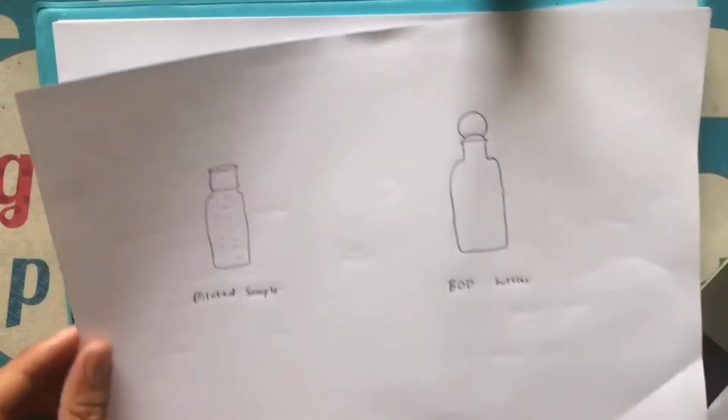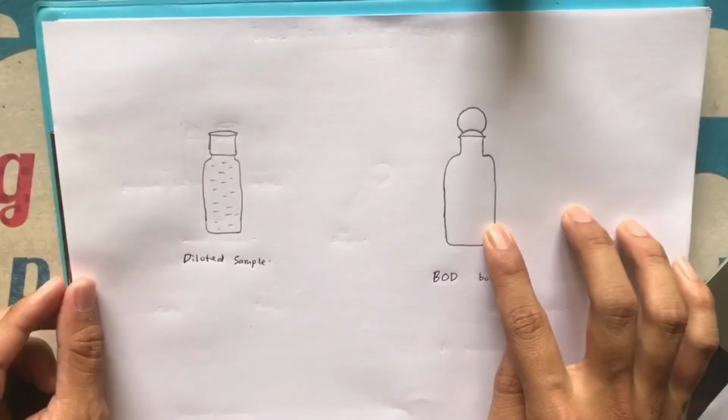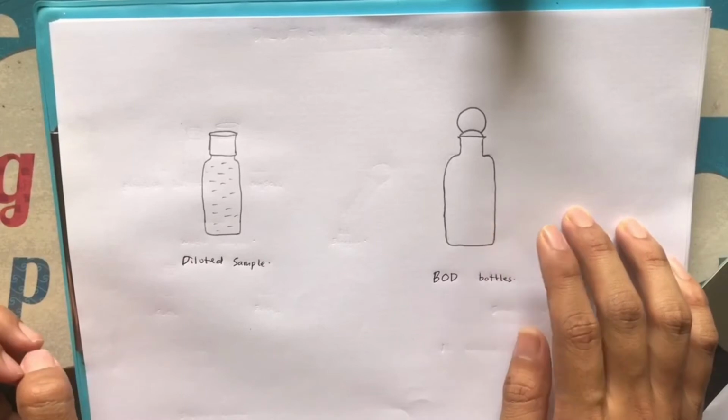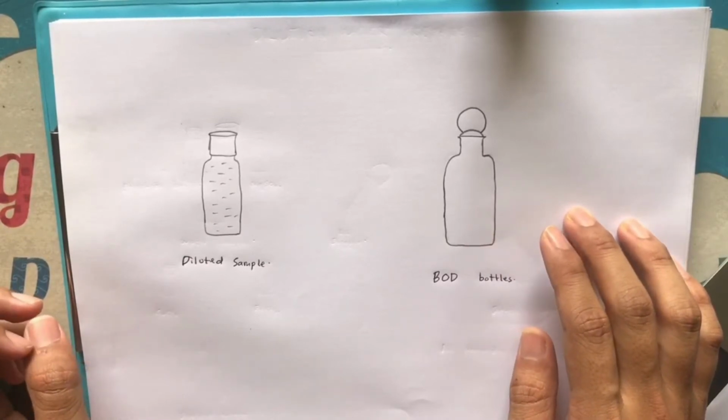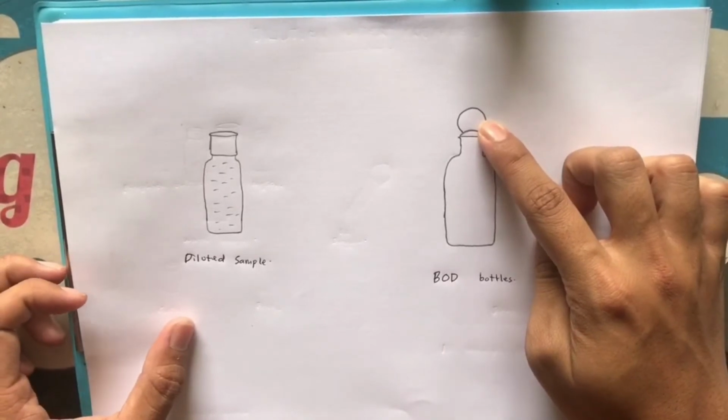Slowly pour the diluted sample into a clean BOD bottle without creating air bubbles. Allow the water sample to overflow the neck of the bottle and insert the stopper firmly.